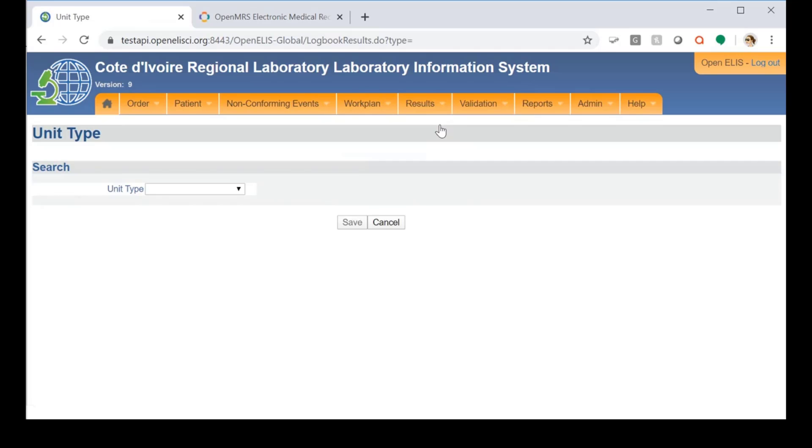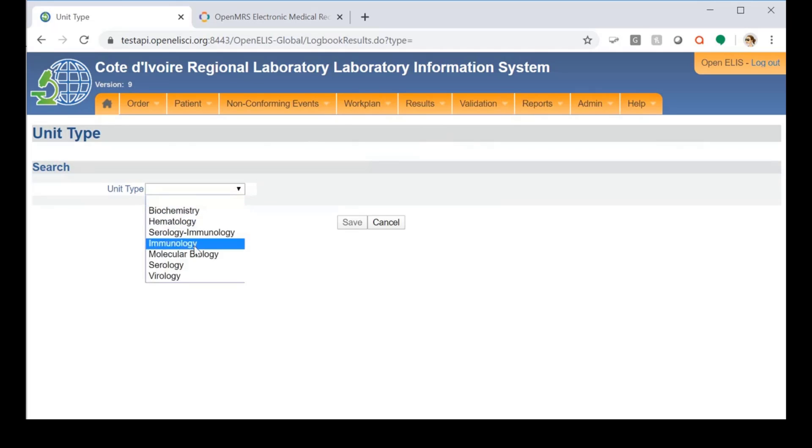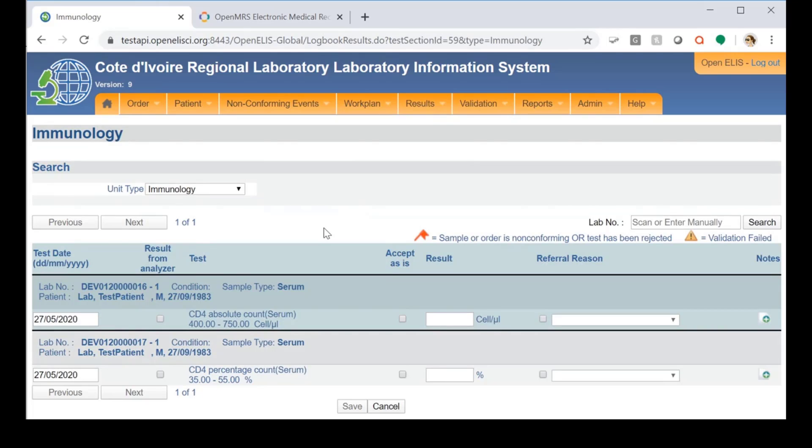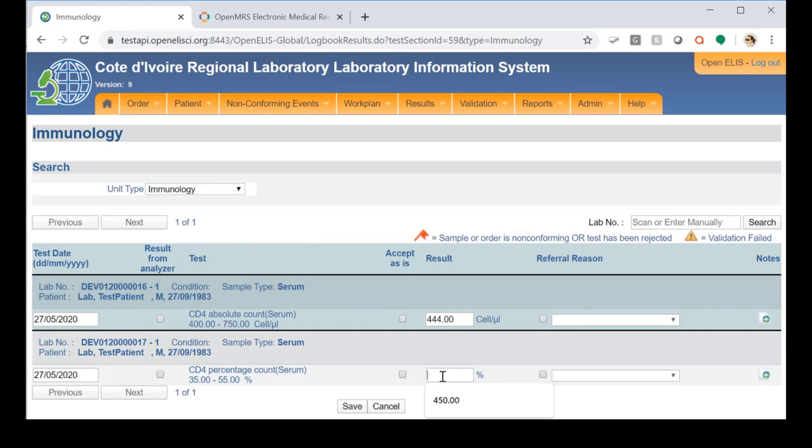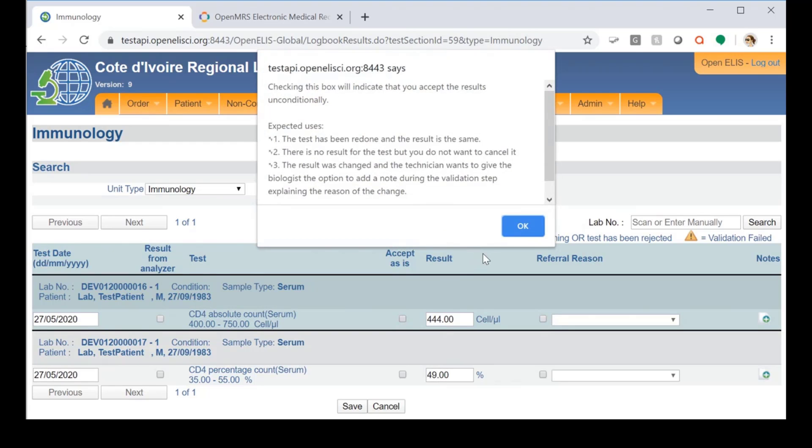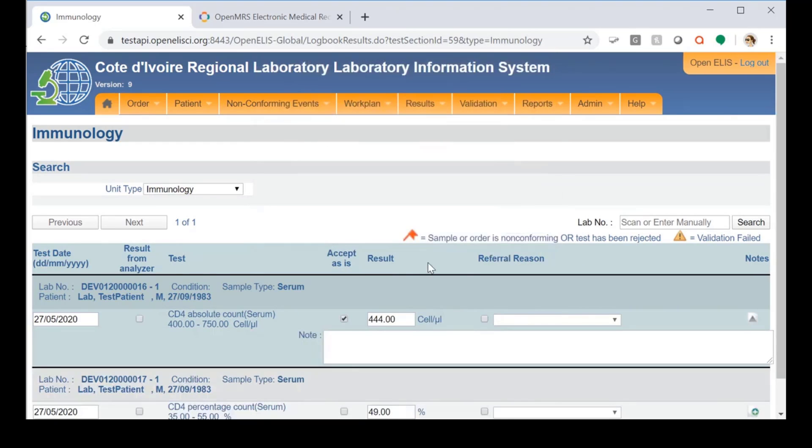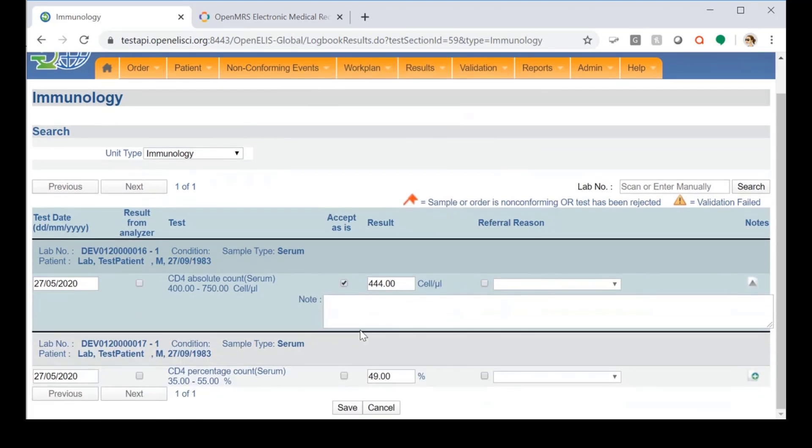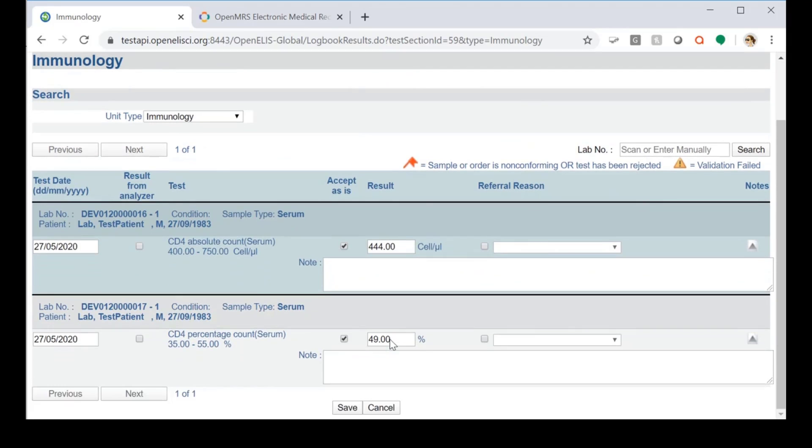Now once the tests are processed, we'll enter the results. We'll enter some sample result values here. Then we'll select accept as is. This serves as an internal validation of the test result.